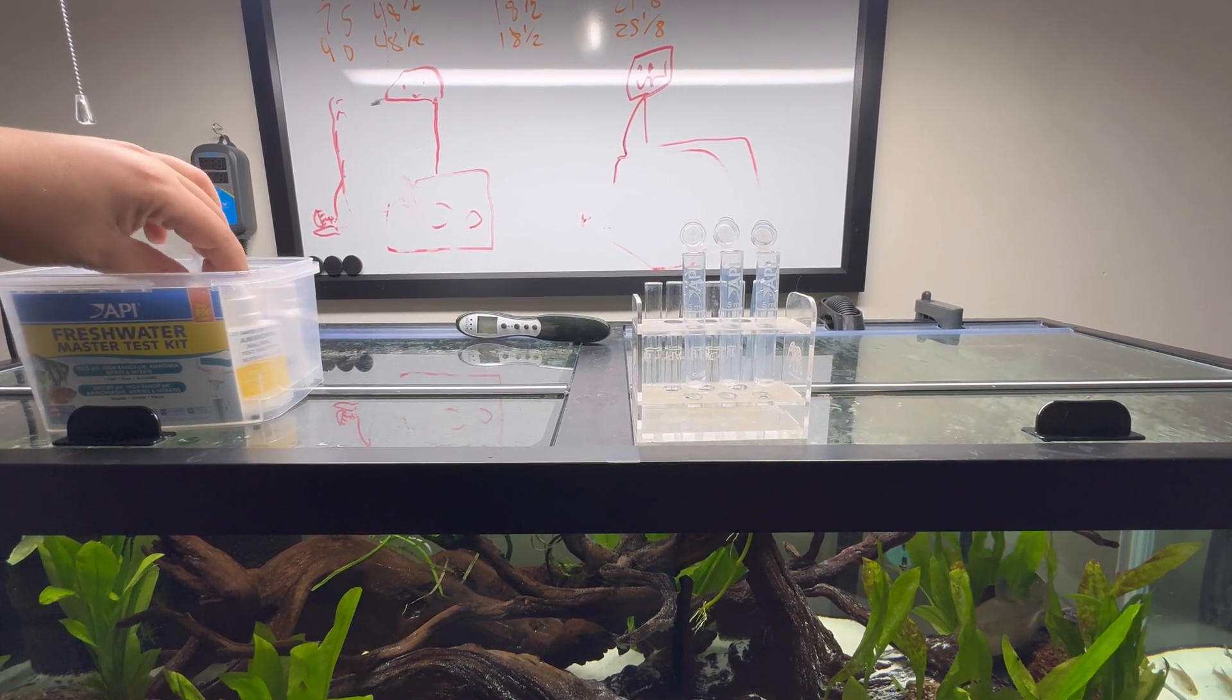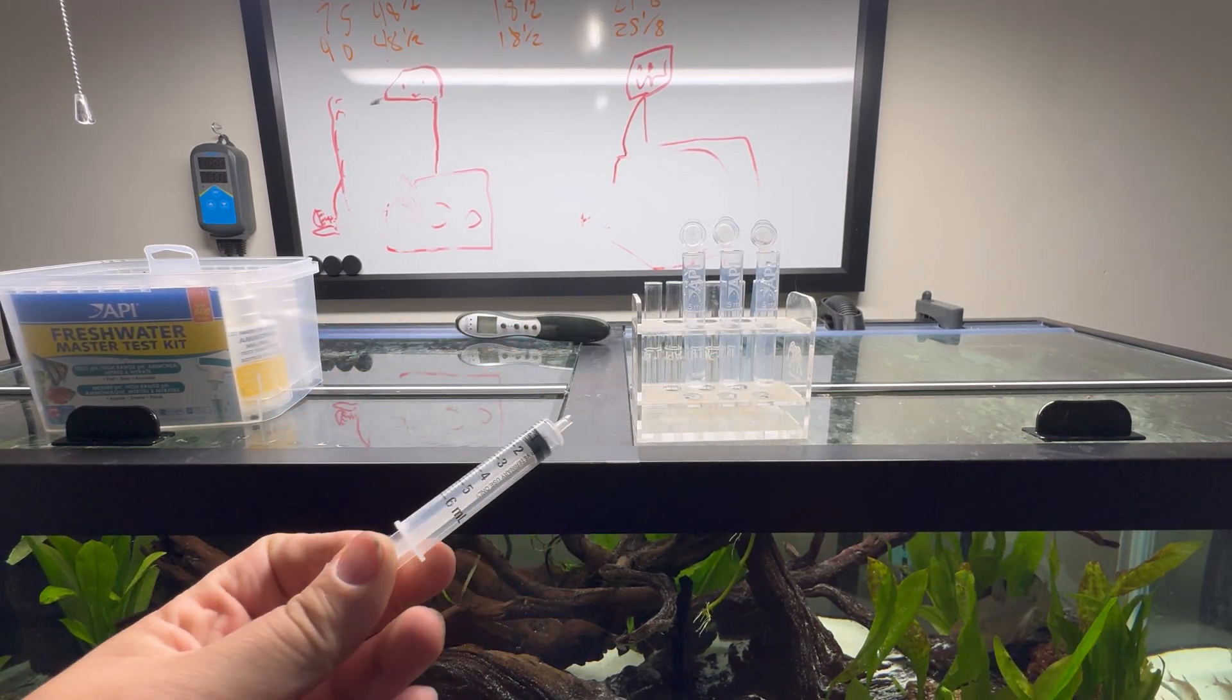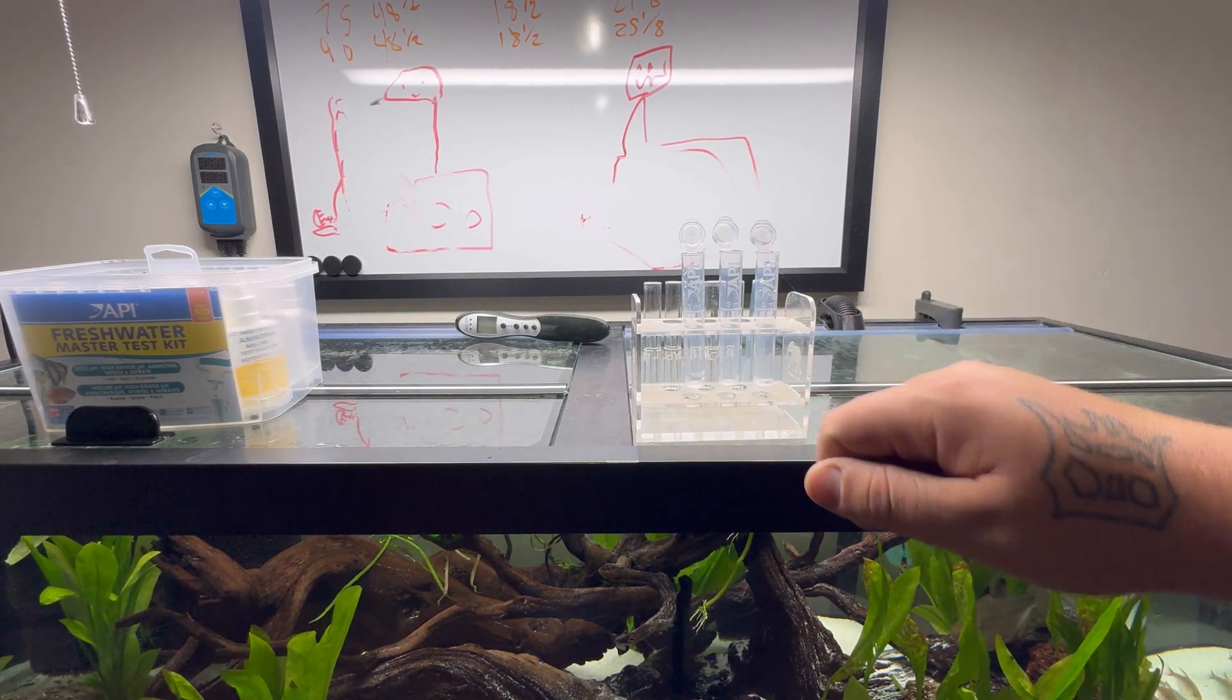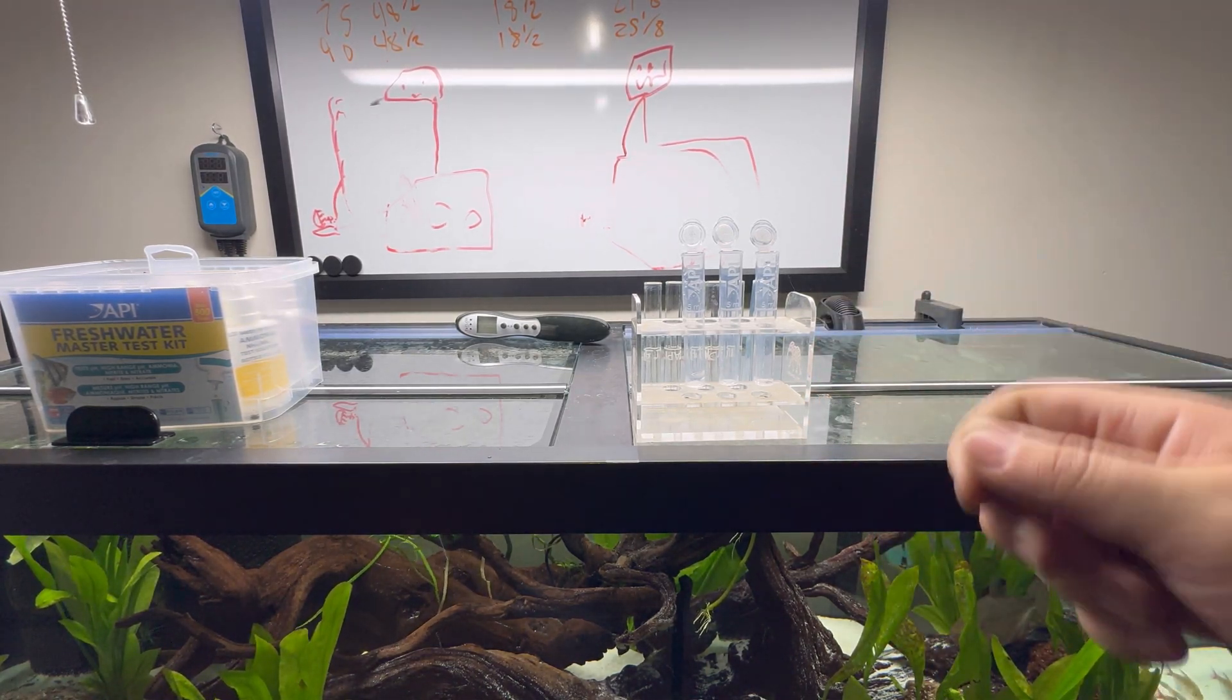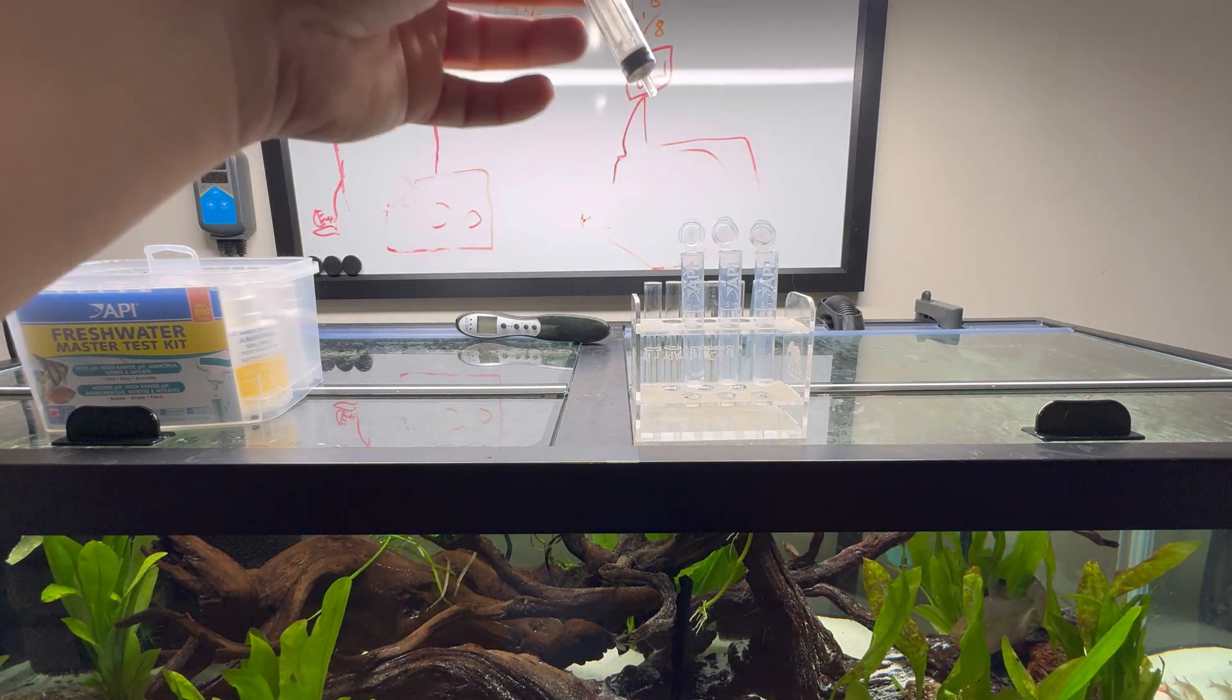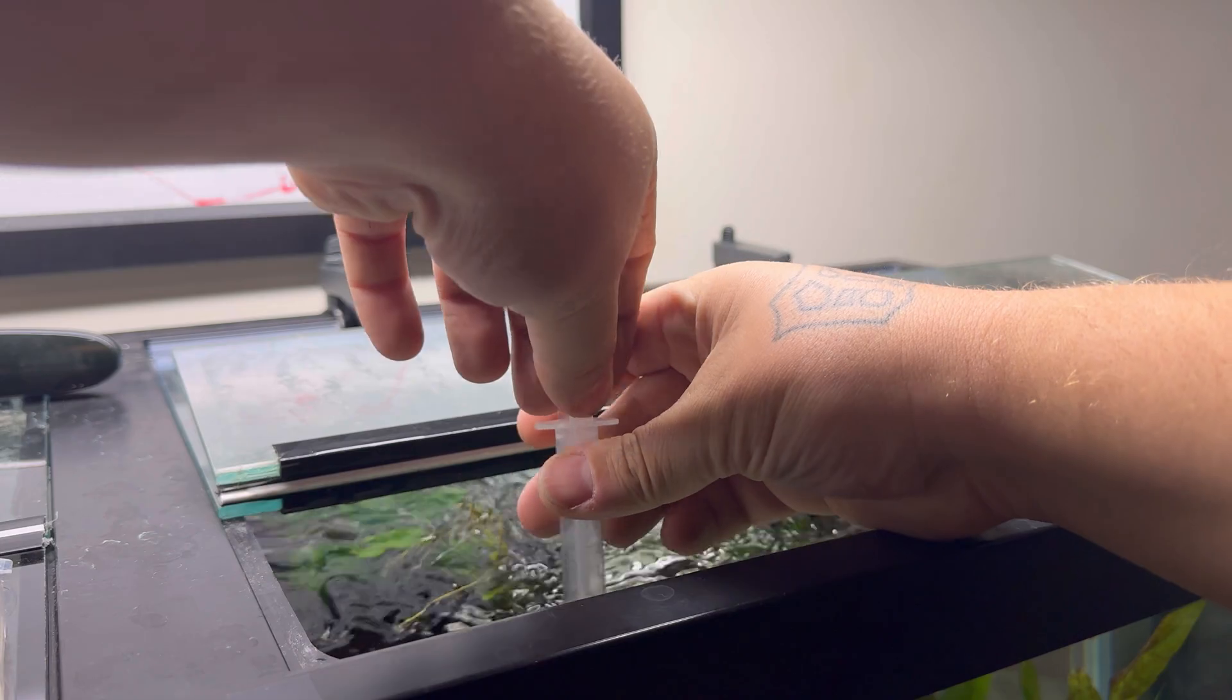The first thing I want to mention: get yourself a syringe. This is going to help a lot in filling these vials. Instead of dunking them in the tank and constantly trying to get that level to five milliliters, you're going to be able to do that way easier using a drop-by-drop method. We're just going to suck up a vial of this.